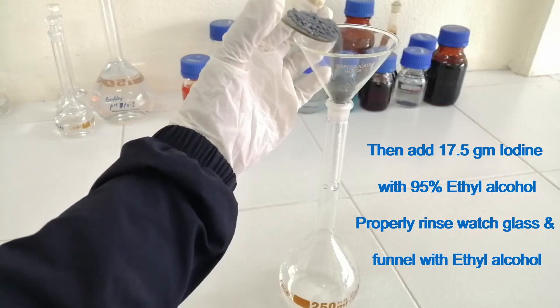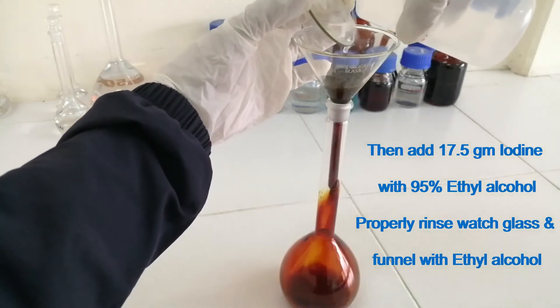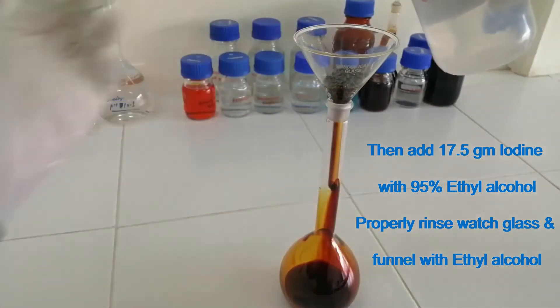Then add 17.5 grams of iodine with 95% ethyl alcohol. Properly rinse the watch glass and funnel with ethyl alcohol.